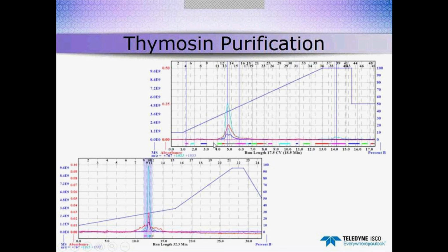So you can see that we've got a fairly broad peak here, not adequate, even though we've hard cut this using the mass spec. Analytical analysis showed that we didn't have purity of about 60 or 70%, which wasn't adequate for the target peptide that we were looking at.